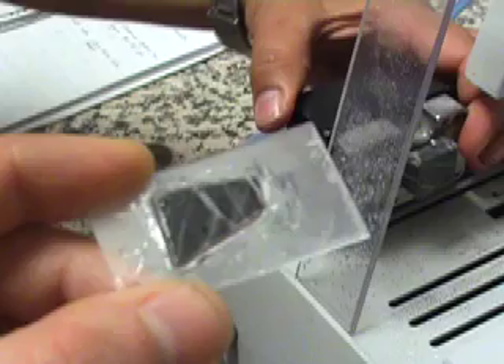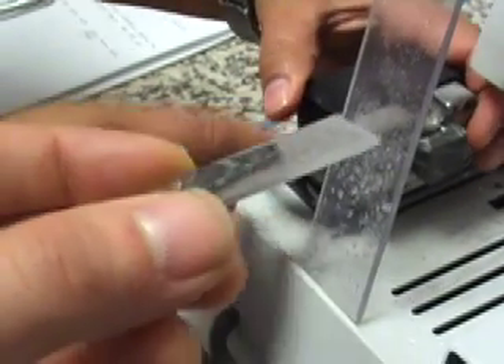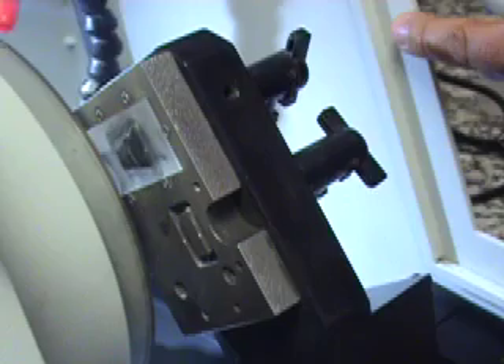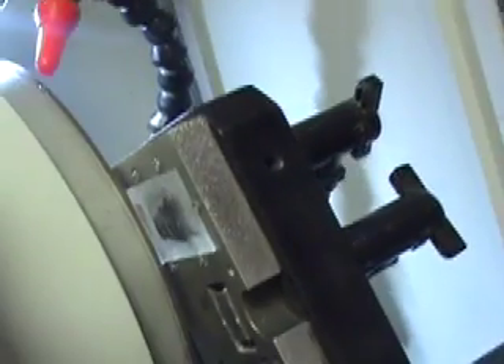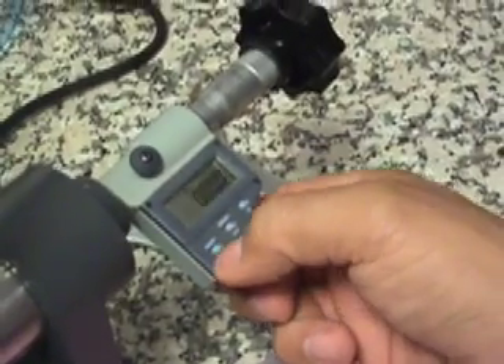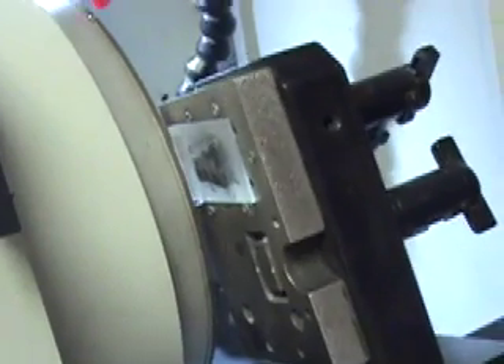This should leave a sample thickness of approximately 1mm. On the grinding station, zero the grinding wheel against the glass slide on the digital micrometer. This enables accurate grinding to a specific sample thickness, usually around 30 microns.